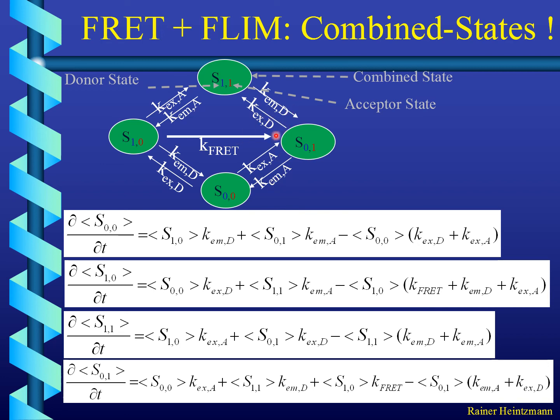You see 1, 2, 3, 4, 5 arrowheads appearing here. Maybe I have to double check that. Yeah, so this one depends on the concentration of all 3 of these, whereas this state, when it emits, does not depend on this concentration. So that is why this one has 1 term less than the other ones.